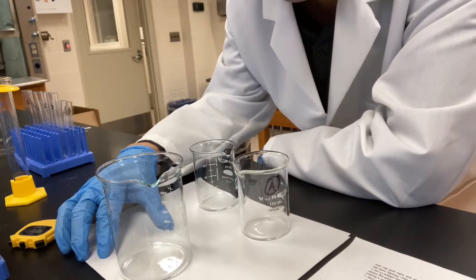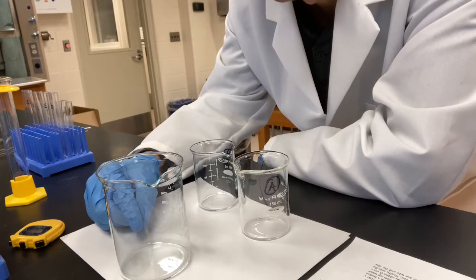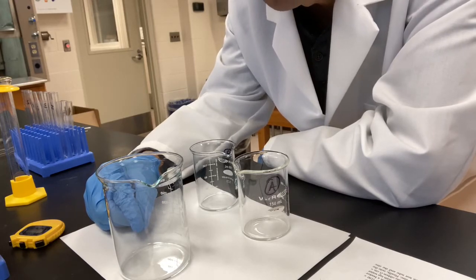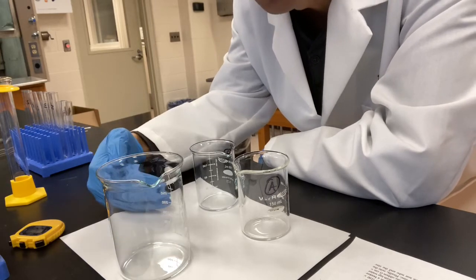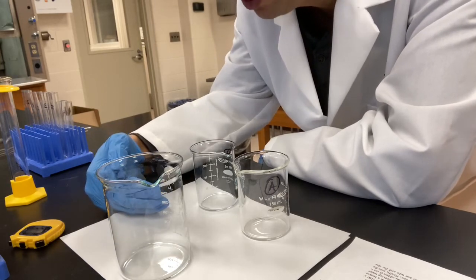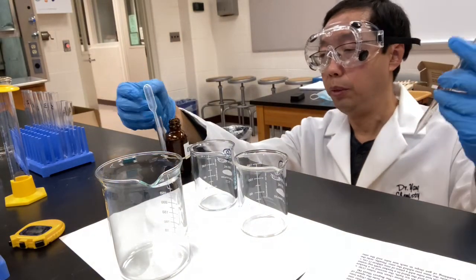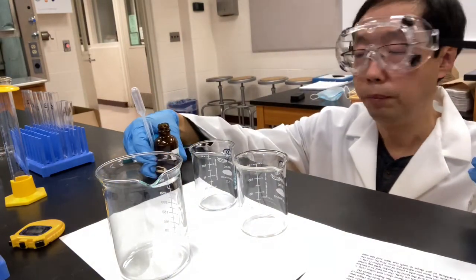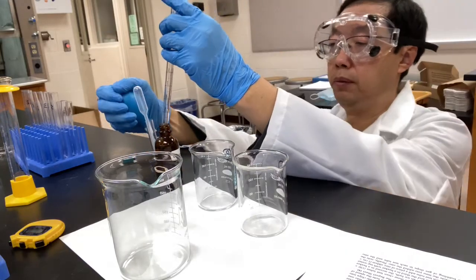So what I'm going to do here is, whenever I see any kind of blue, as long as the blue appears, I stop my watch. And I will do that for the same 3 trials. All right, now I'm going to start. So first, I'm going to measure 2 mL of potassium iodate.